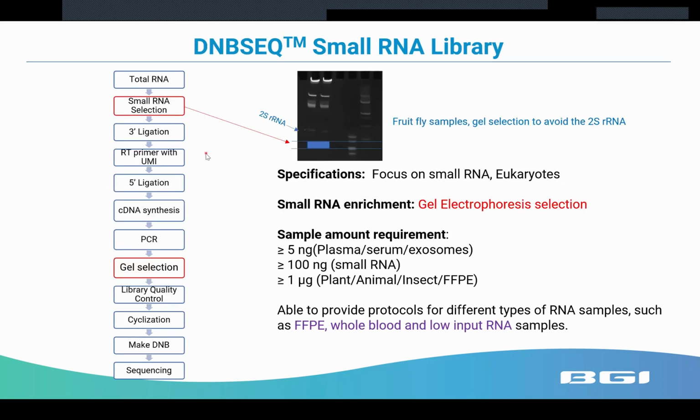For small RNA library, the small RNAs are really short, right? We use size selection by gel electrophoresis to enrich them during the library preparation. On the left is the procedure of the small RNA library preparation.